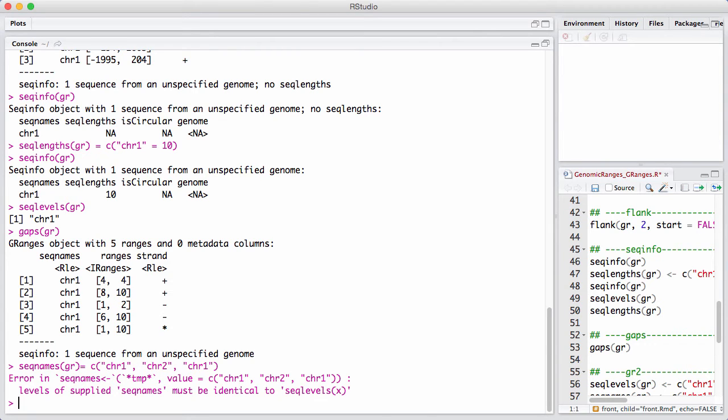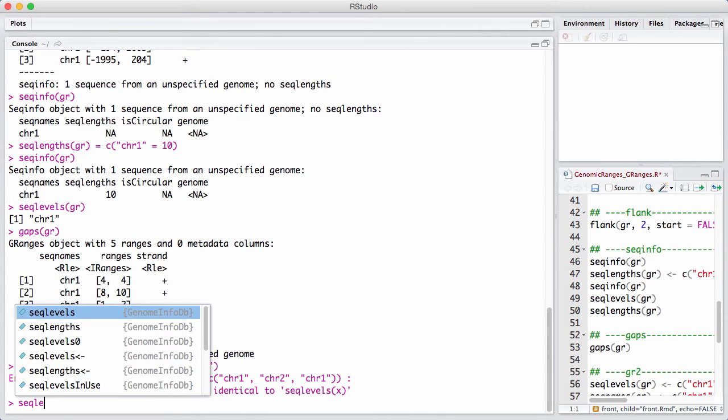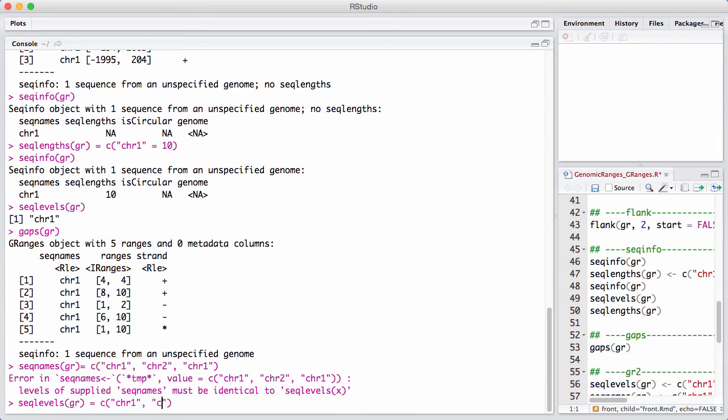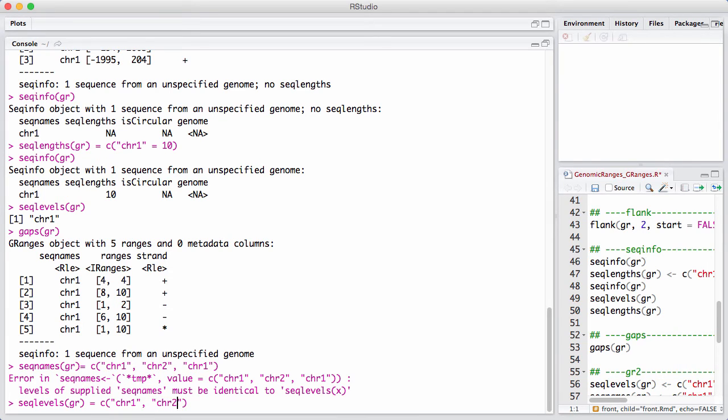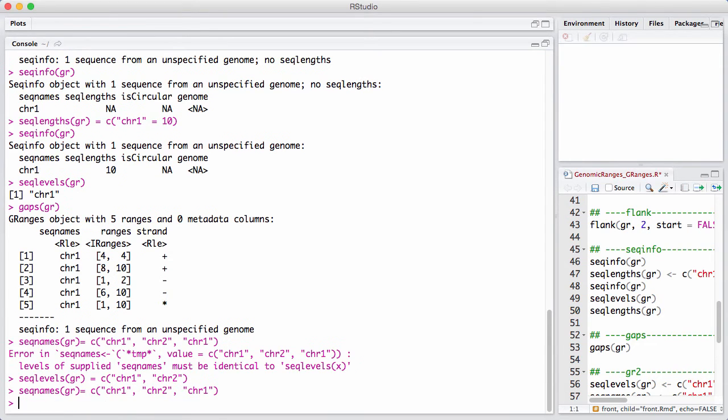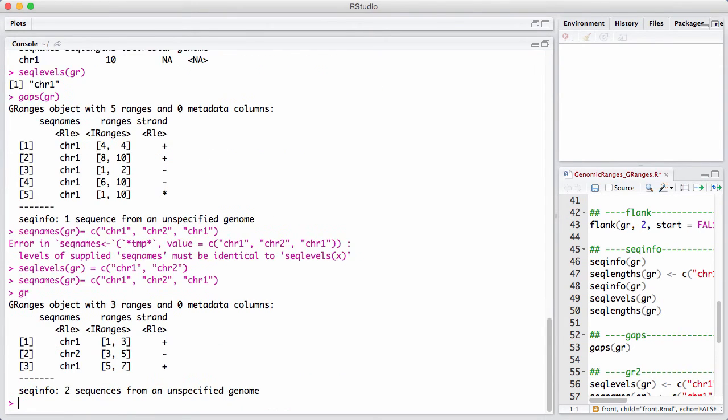So we need to start off by either reconstructing the object, or we need to tell it that there's actually two different levels. And now, when it knows that the seed levels can take two different values, we can assign a new vector of seed values. Now we have two different chromosomes here.